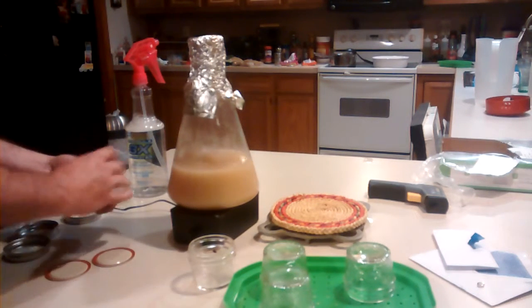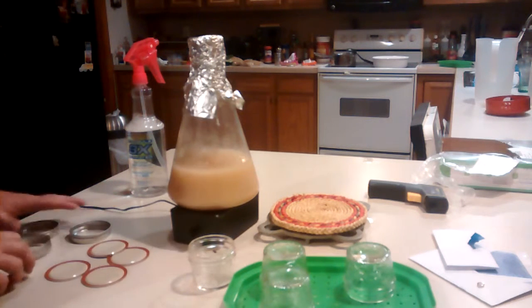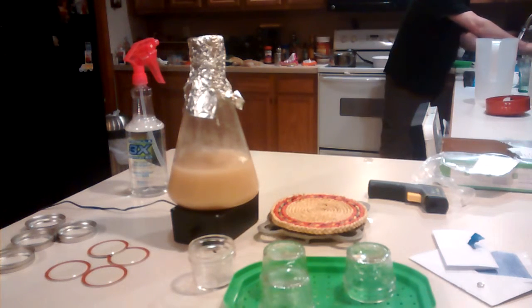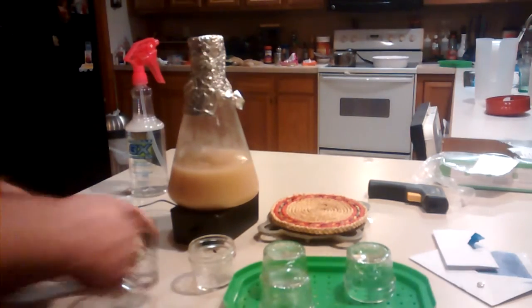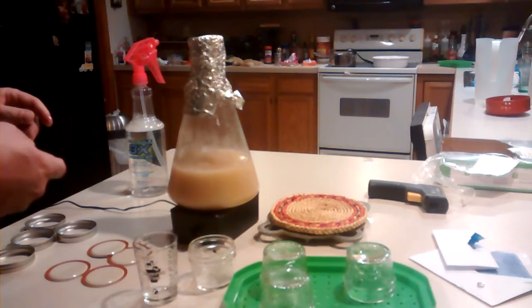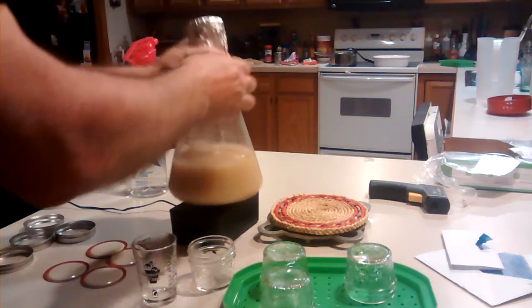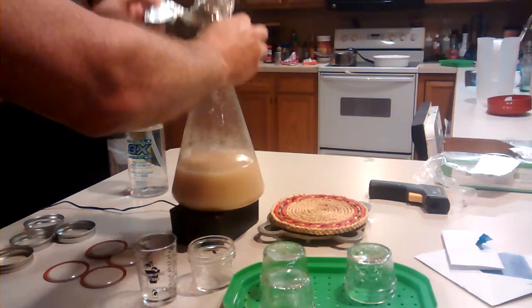What I'm going to do is pour some yeast into these 4 jars, roughly 100 milliliters. It's around 3 ounces or so. Roughly 30 milliliters to an ounce. I forget the exact number, but that's close enough for government work. Alright, still spinning. I'm going to turn the stir plate off. Try to find the little stir bar with the magnet there, so when I pour, it doesn't fall out.